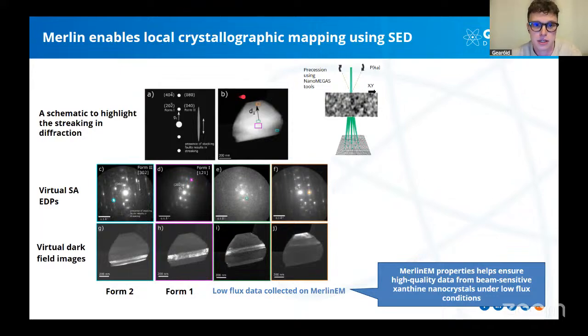Remember, each of these pixels actually has an associated diffraction pattern with it. These colored rectangles correspond to regions from which position averaged diffraction patterns are obtained, and then these are those position averaged diffraction patterns. Then she applied a number of different virtual objective apertures to her data set to generate these virtual dark field images.